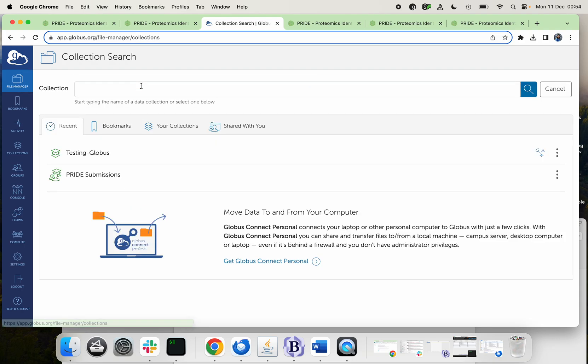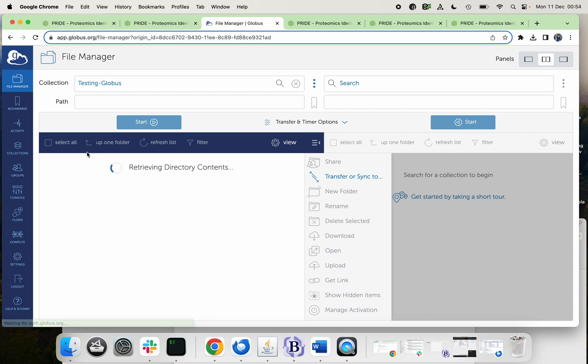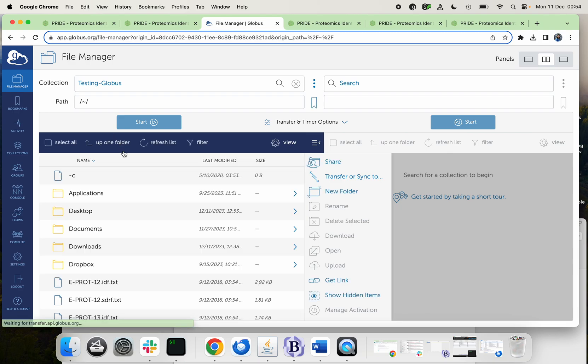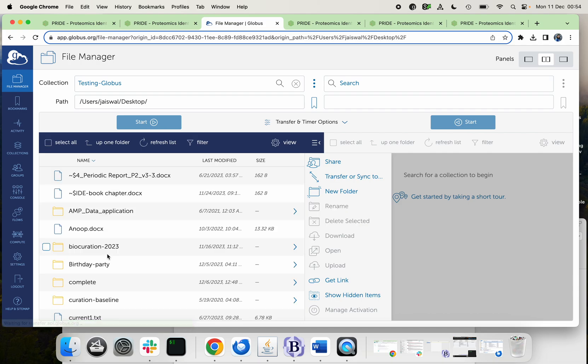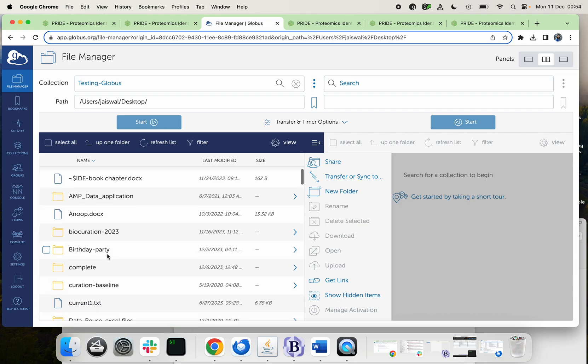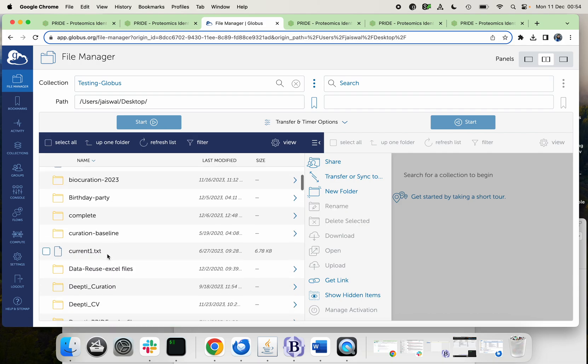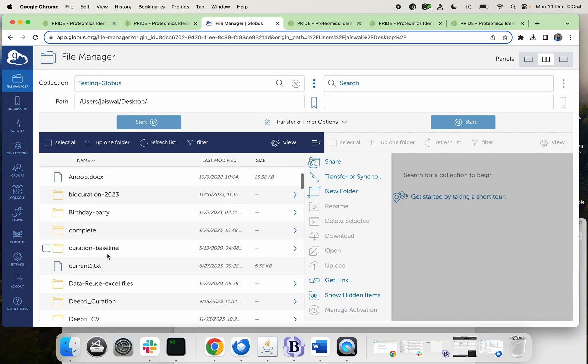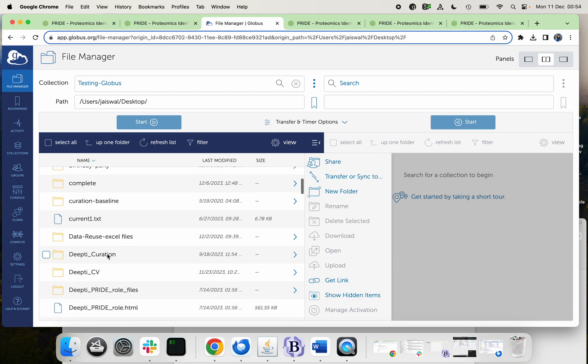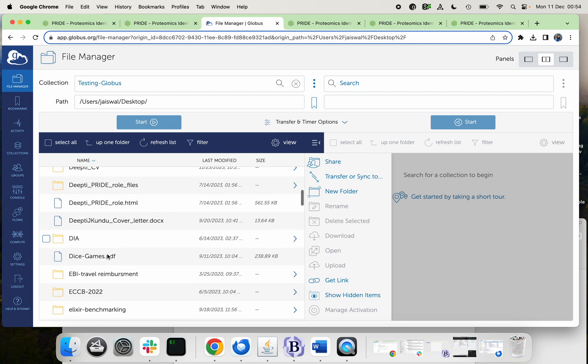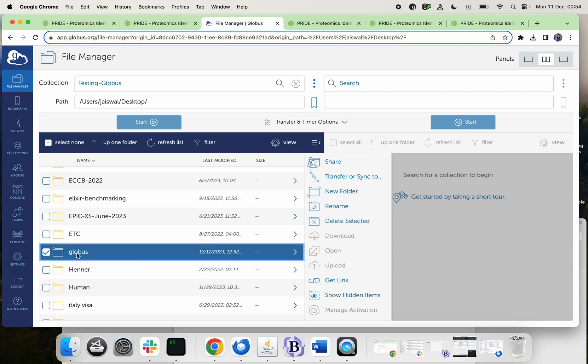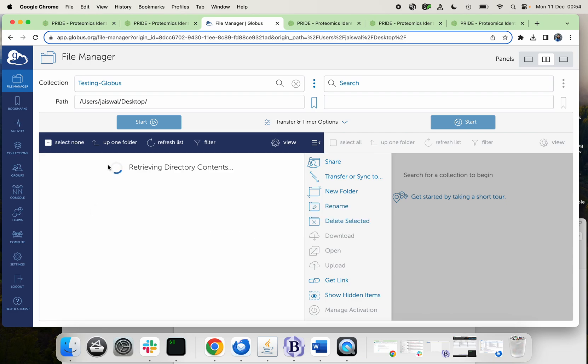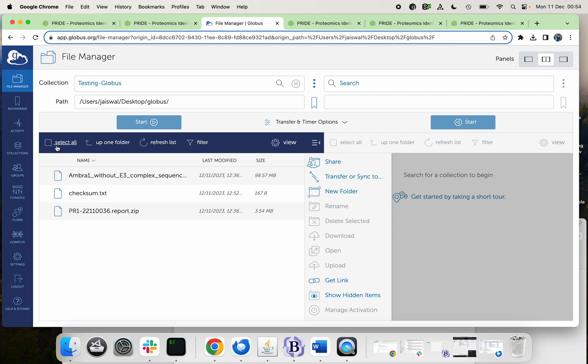So here, while setting up you must have created your collections. So you just click your collection, and now you should be able to explore your files. Just navigate to the place where you have kept your files, and here just open the folder and select all your files.